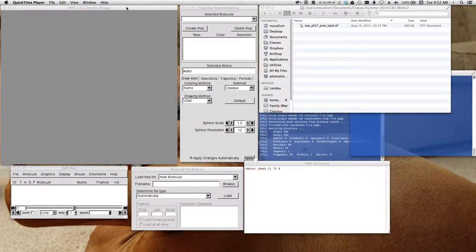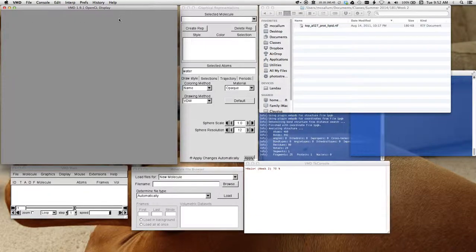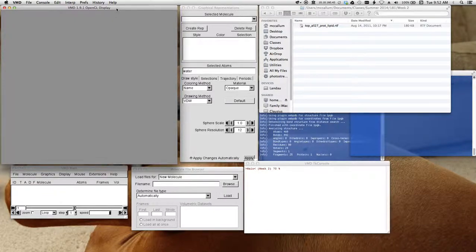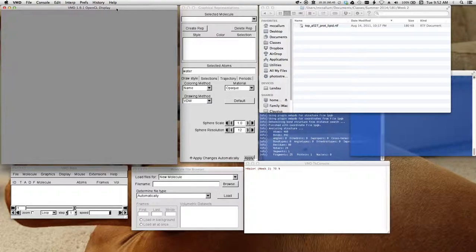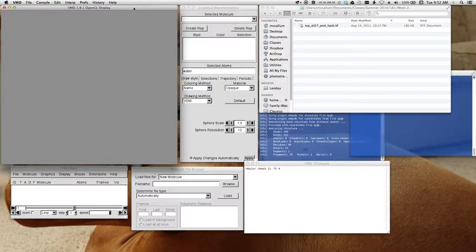Okay, so what I'm going to do here is run through the PSF PDB formation steps from week two. I'm just going to download a small protein from the Protein Data Bank and make a matched PSF and PDB pair. You have to do this in segments, and the PDB files at the Protein Data Bank are not really set up for simulations. They're set up for other things, maybe just from data, so we have to match them up.